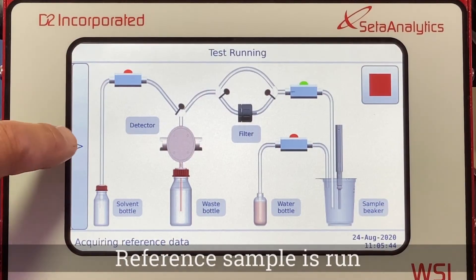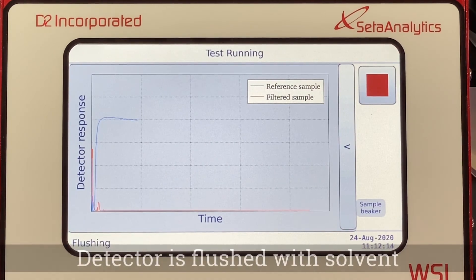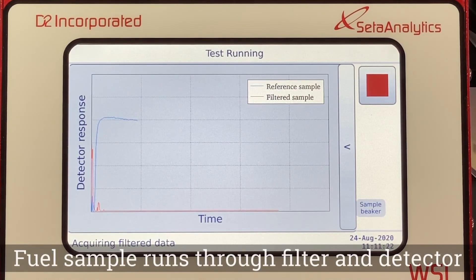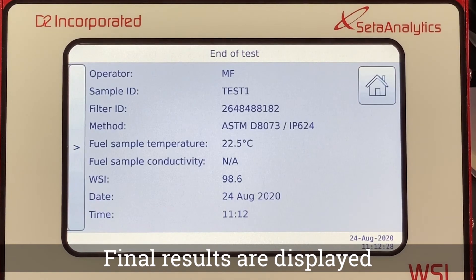The instrument runs a reference sample bypassing the filter but through the detector. The detector is then flushed with solvent. The fuel sample runs through the filter and the detector. At the end of the test, the result is displayed on the screen.